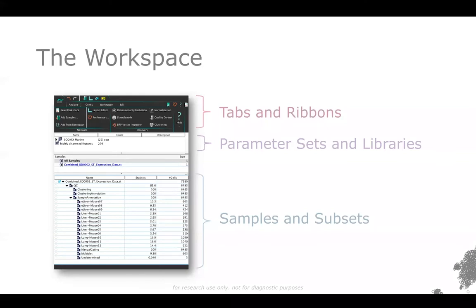And that can be really useful for continuing to iterate through your samples, and also is going to be a great way for you to look at things like gene set enrichment analysis when you get to the end of your analysis. Okay, and finally, at the bottom of the workspace, there's a samples section where all of the subsets of cells are going to live. Typically, we're dealing with a concatenated data file, and so the groups aren't as important, but there is a groups panel in that workspace as well, you might notice. I don't usually talk about that one too much.